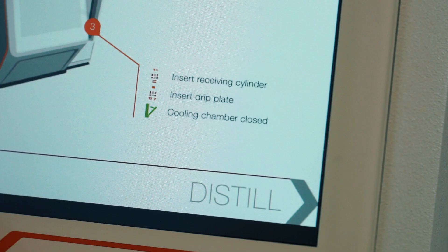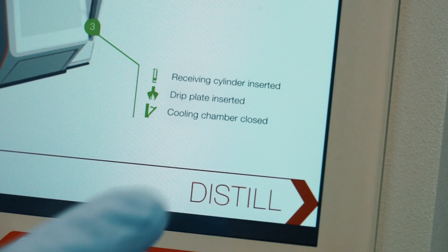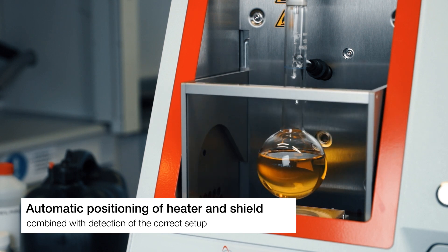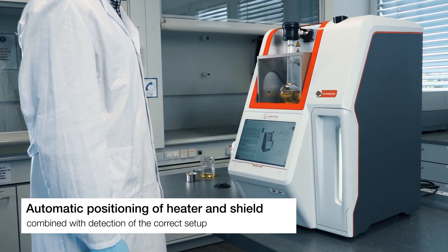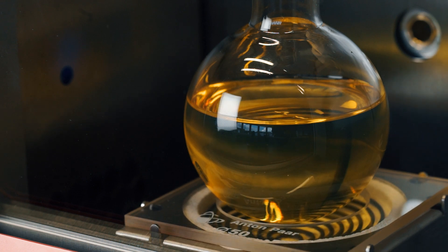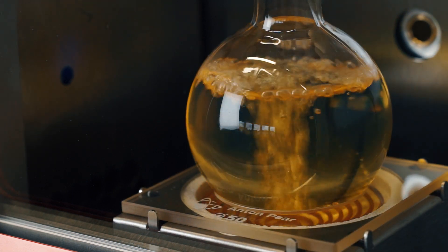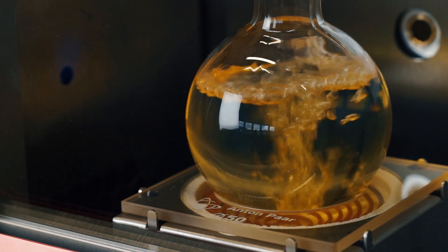After the correct flask setup is detected, the automatic lift moves up the heater and the shield to the correct measurement position, avoiding any risk of breaking the flask. A smart heater regulation ensures the standard compliance setting of the heating parameters for consistent results.